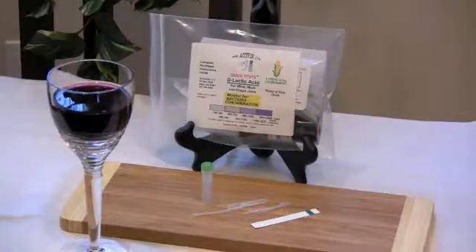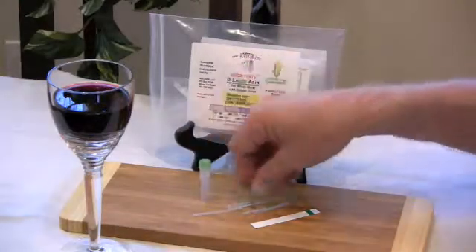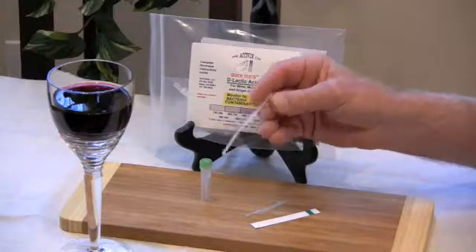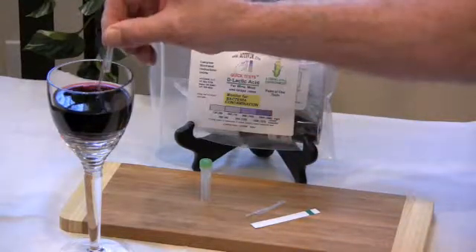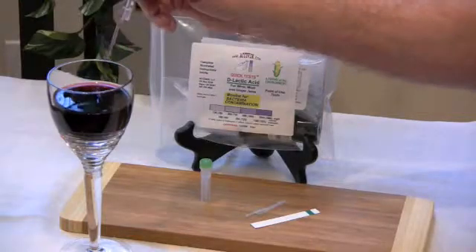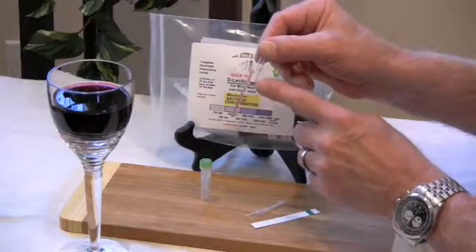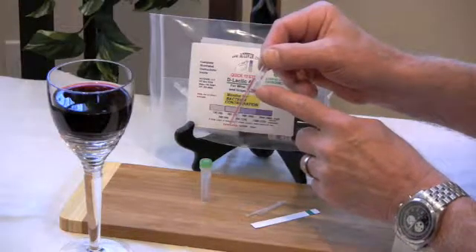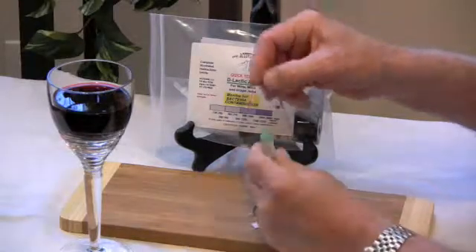Step 1 dilutes the sample 1 to 4 to reduce the concentration of interfering substances. To run step 1, you'll need a diluent tube with a green cap and a long tip sampler. Squeeze the upper bulb once, place the tip of the sampler into the wine, and release the bulb. The sample is contained in the straight portion, and excess sample is contained in the overflow bulb. Wipe the outside of the tip with a downward swipe to remove excess sample.